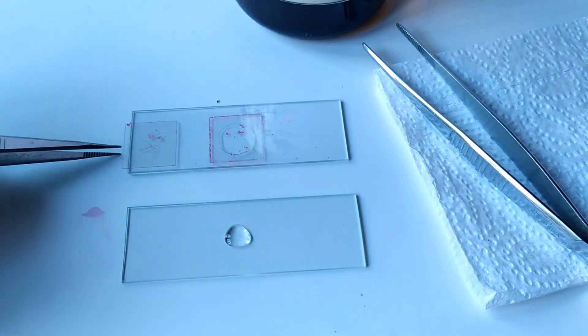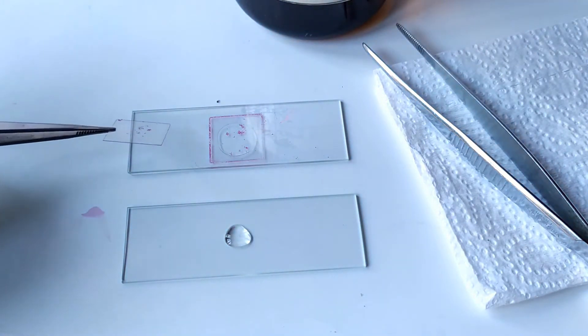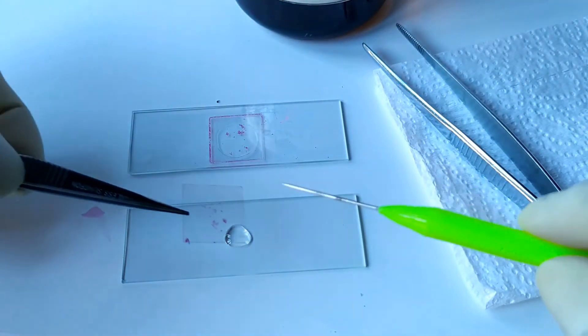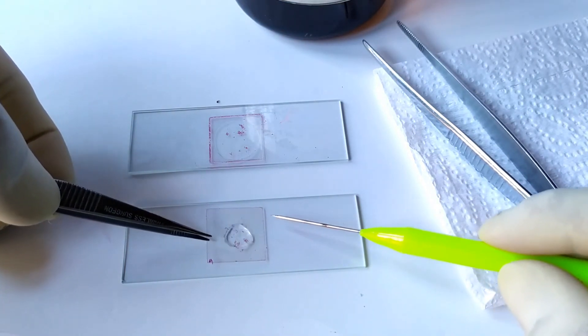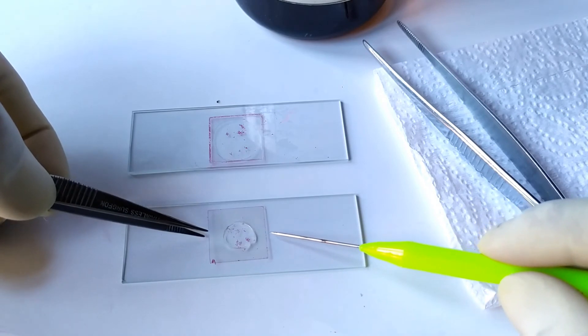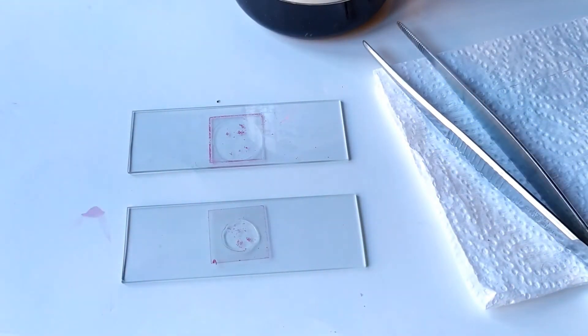Next, hold the cover slip containing the cell materials using a forcep. Turn it upside down such that the surface containing the material now comes on the lower side. Then carefully place this cover slip onto the mounting medium contained in the fresh glass slide, making sure to avoid the trapping of any air bubbles.